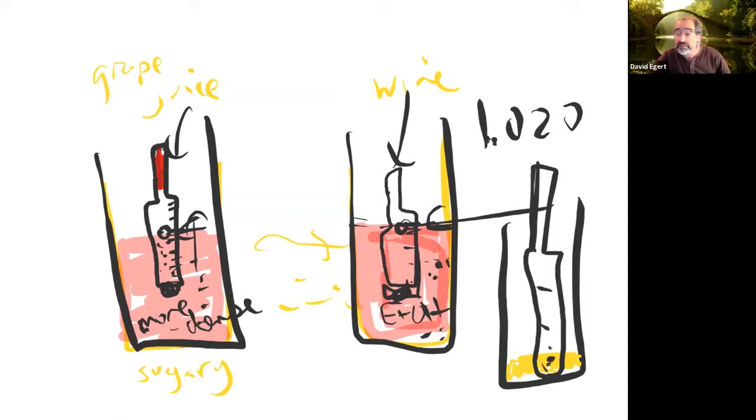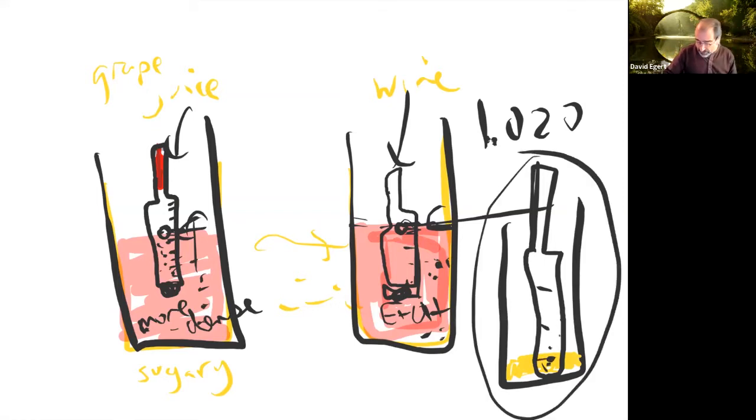What that means is you cannot get a measurement. So the reason I'm saying that is, what would be the specific gravity in this case, if I try to get the measurement, but there's not even enough urine to float it?